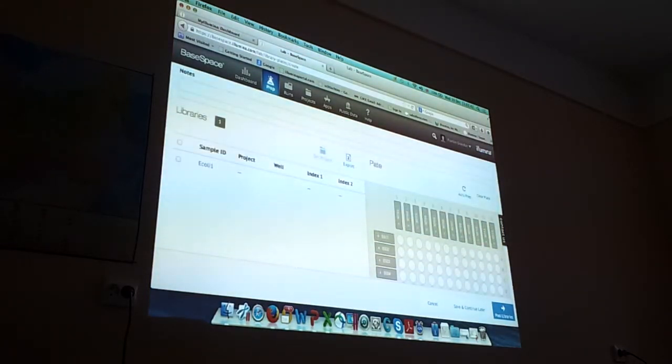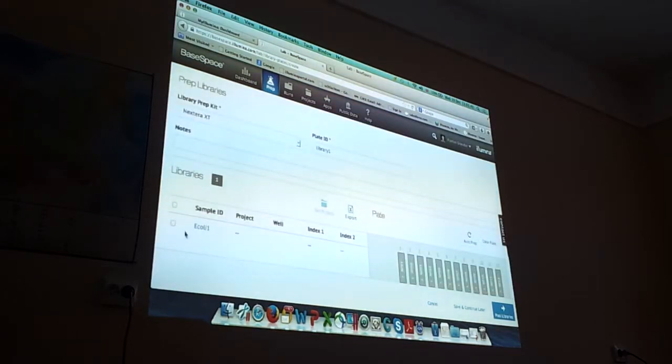And then here you have your sample library. So you can choose this one.